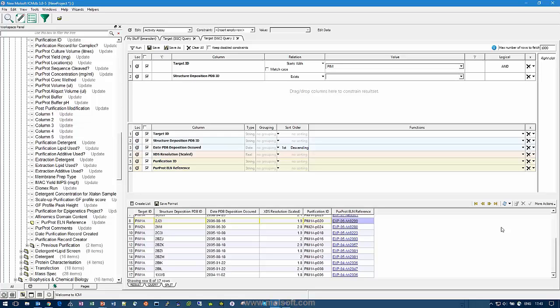So another question is, can you modify existing records? Yeah, that was going to be the next thing I was going to show. And how do you track changes? Yeah, I can talk about that in a minute. Are there any other questions, Andy, before I go to the editing bit?